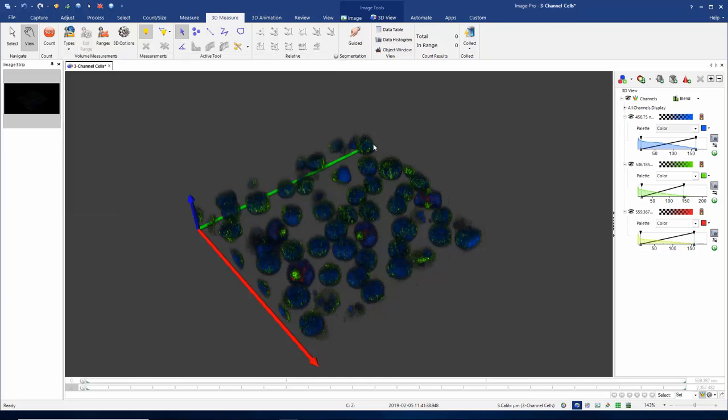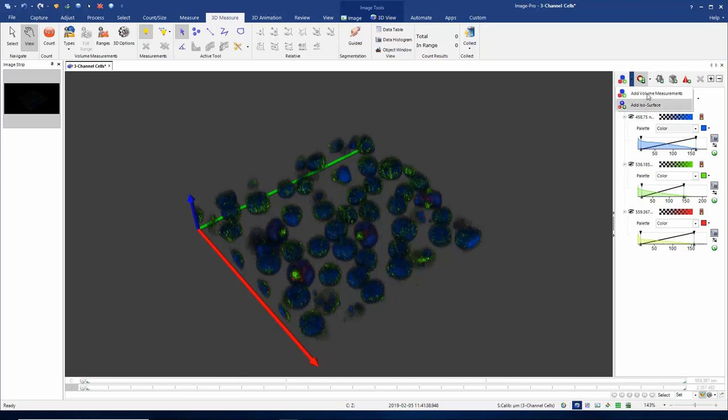I now need to tell the software how I want to separate my objects from the background. If we look in the 3D view, we have two options: one is to add volume measurements and one is to add isosurface measurements. Each of these options has its own advantages.